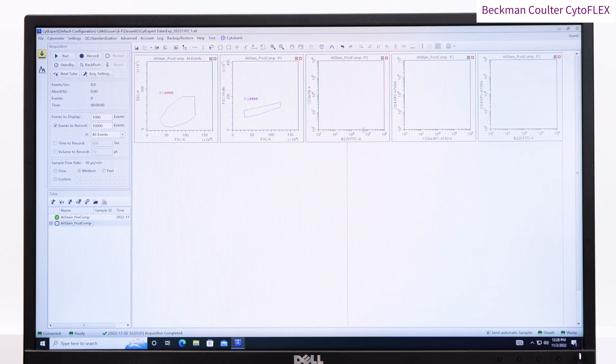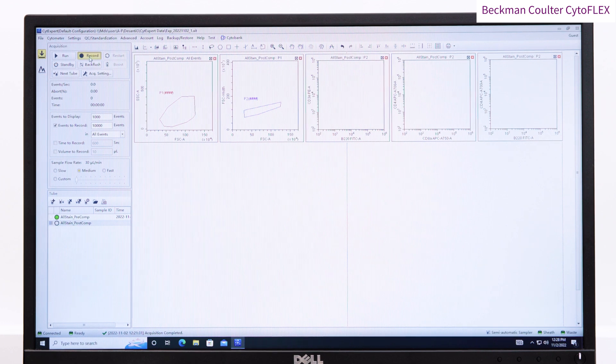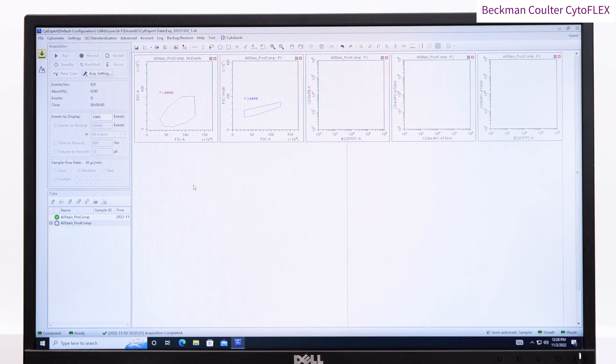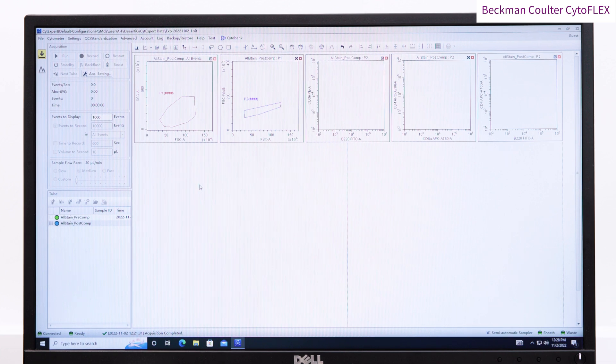You are now ready to record your sample. On the left, choose events to record, time and volume, and adjust the flow rate as required. Press record.